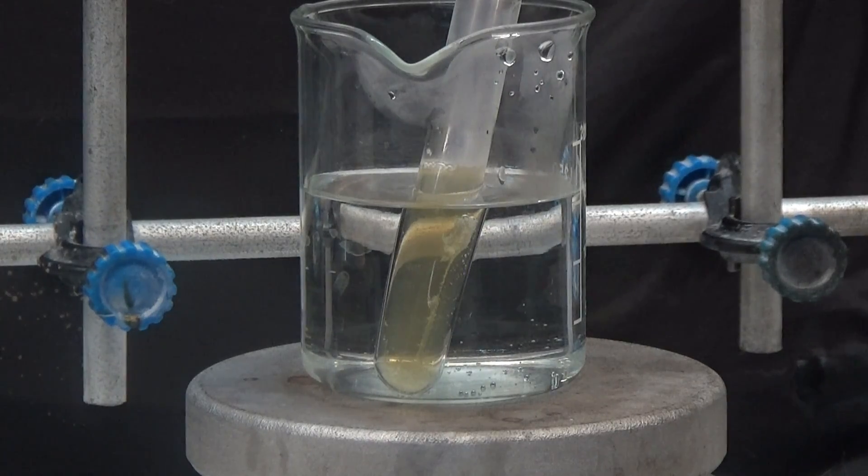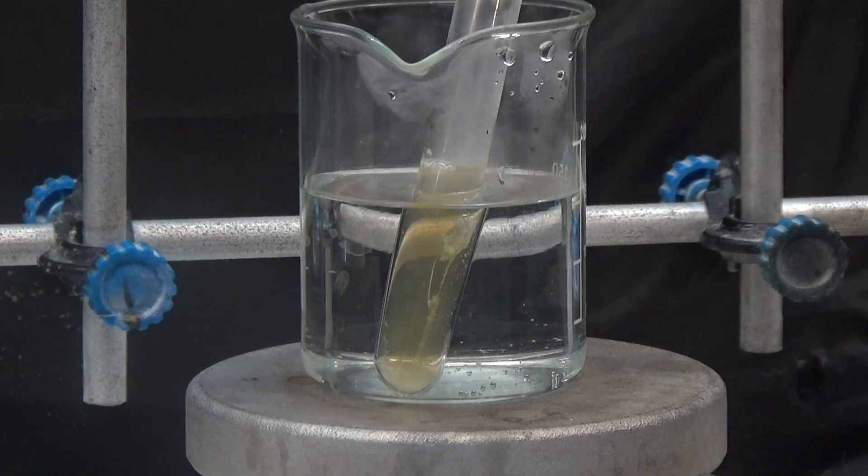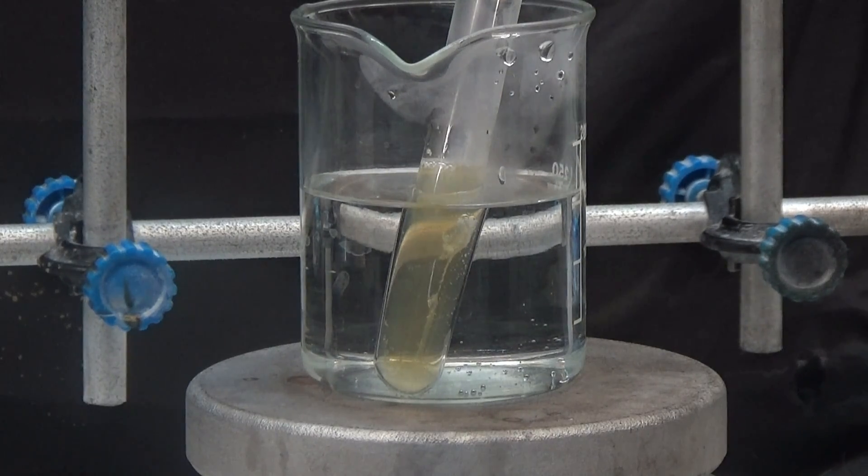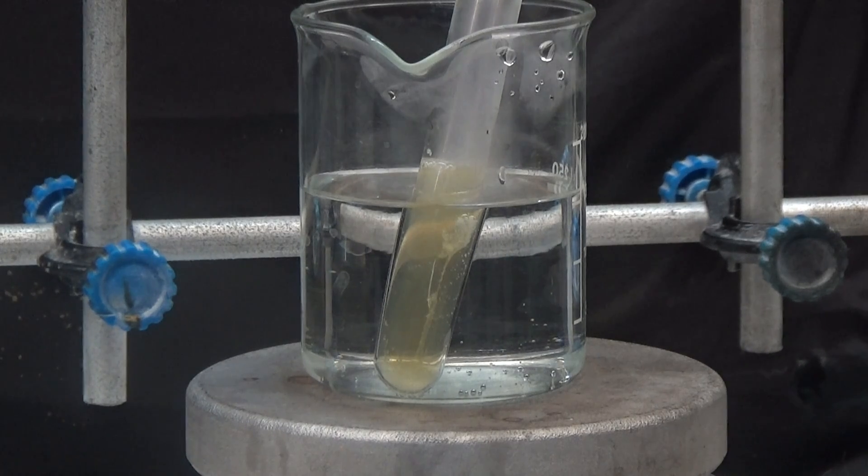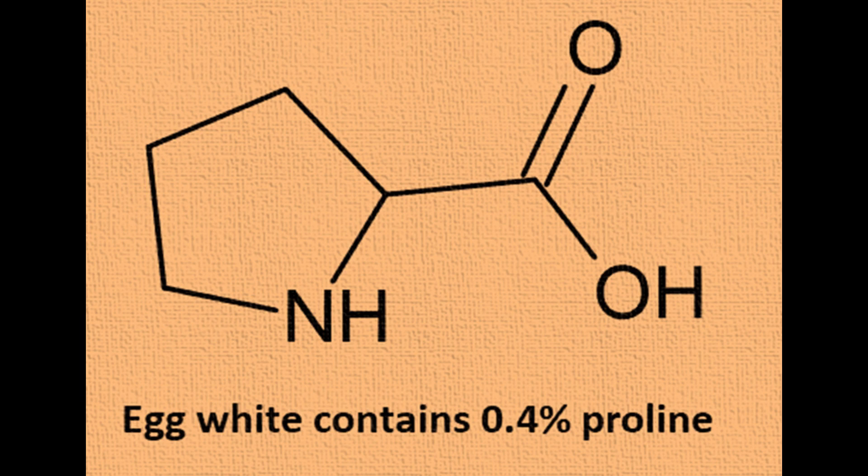In this test we had to heat longer than with glycine. Then it turns yellow because the egg white contains proline. Proline gives yellow color with the ninhydrin reagent. It does not give violet or blue because the proline has amino groups substituted.